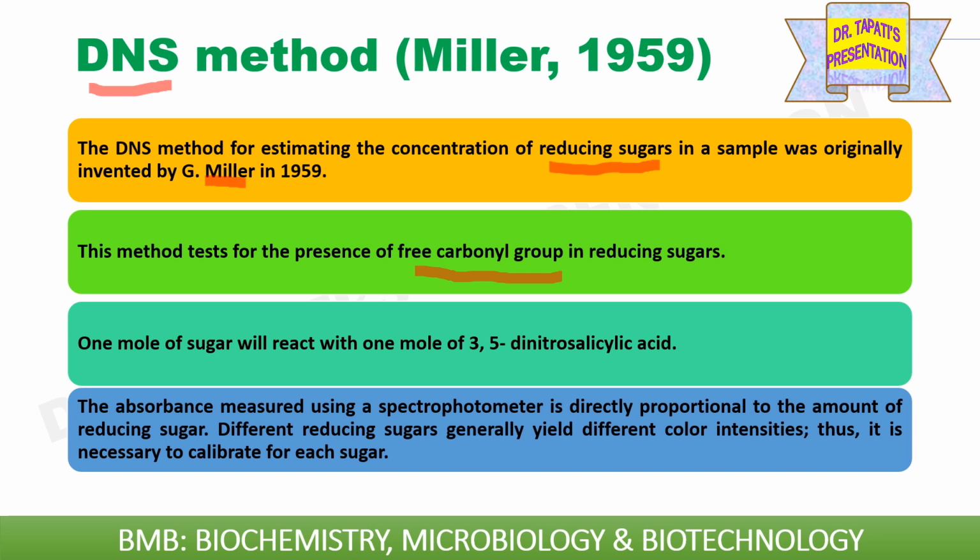So if you want to measure concentration of glucose, which is also a reducing sugar, you have to make standard curve of glucose. Or if you want to measure concentration of maltose, then you have to make standard curve of maltose following this method.